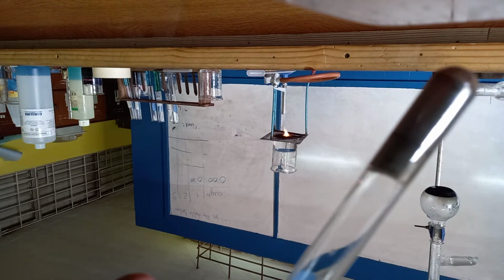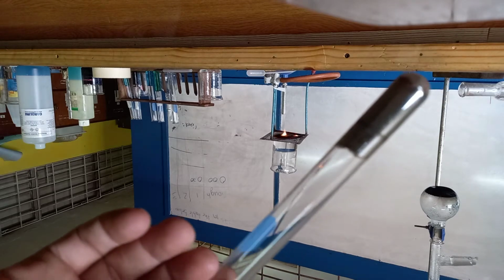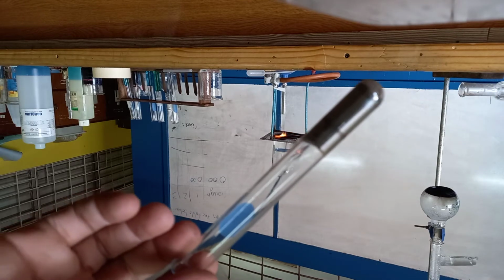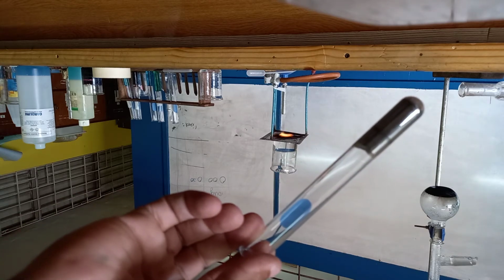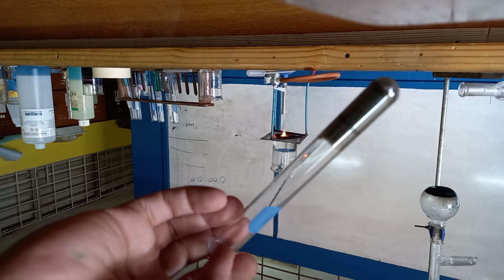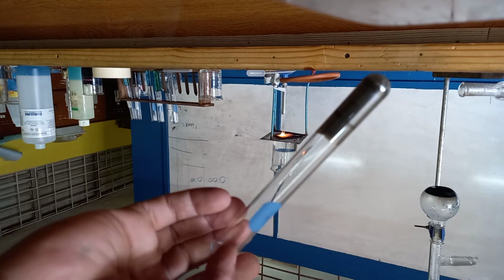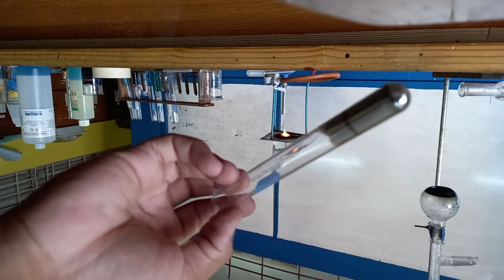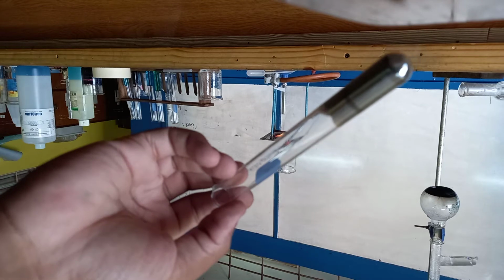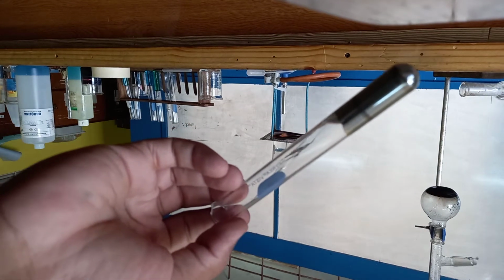And as you can see, if you had watched the previous video for the reaction of aldehydes, this one is a much better silver mirror. As you can see, it has the metallic look, a much better metallic look. So this is with the product we have just obtained from the oxidation of the ethanol, right?